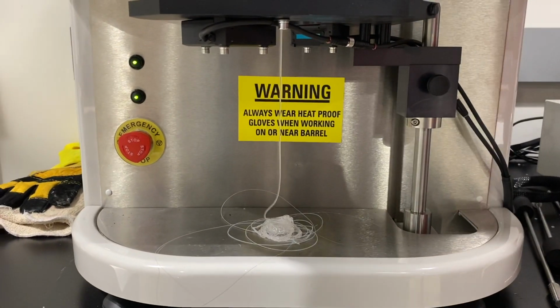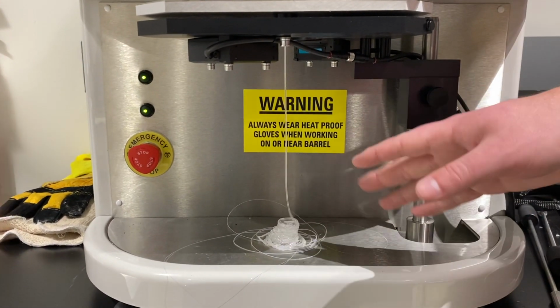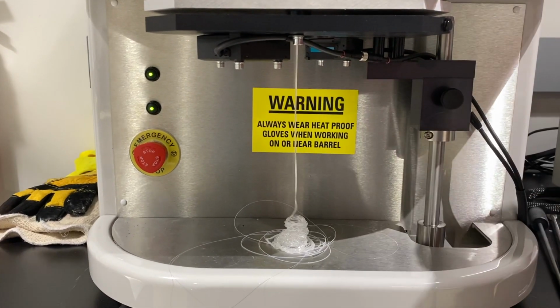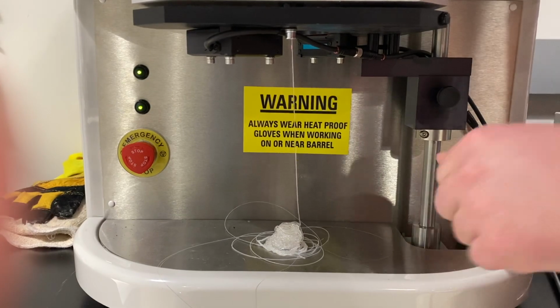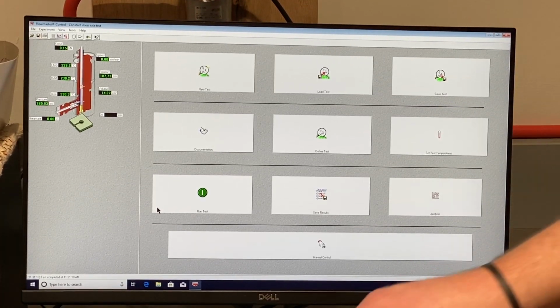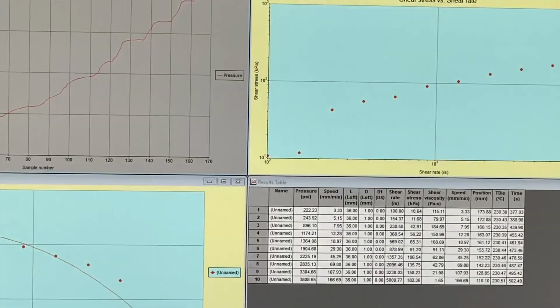Alright, so we're already in stage 9 now. Now stage 10, and you can see it's extruding the material quite quickly, and we're getting a nice little spiral of molten plastic, and it just stopped. Alright, now that the test is over, we're going to come over here. I'm just going to click Analysis. It's going to give us our data.